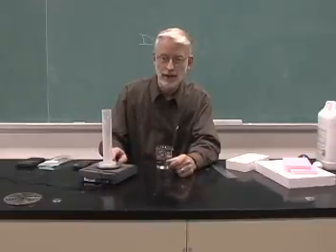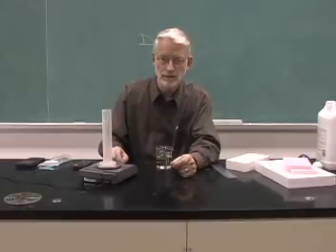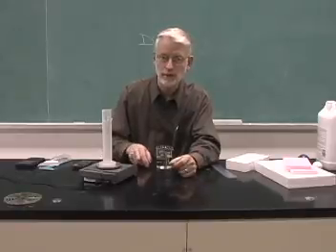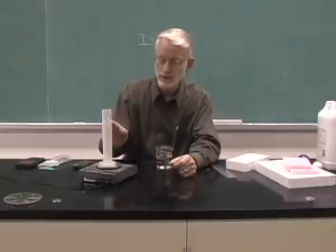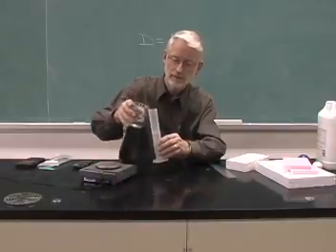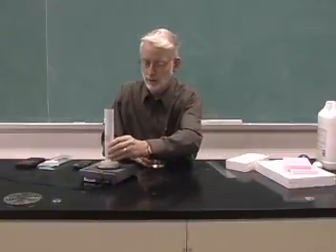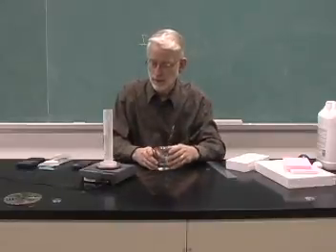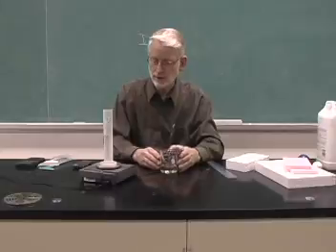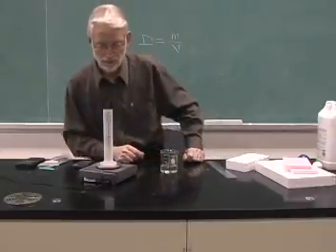And actually, one of the nice things about a digital balance is that we can tare it, which means that we set it to 0 with the mass on it. And now I can just add some water to that and determine its mass. And the mass that I have here is then 67 grams.